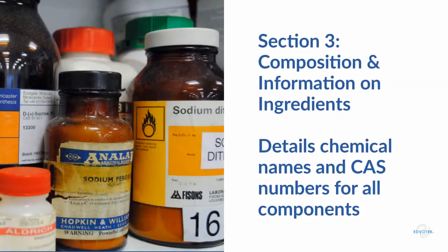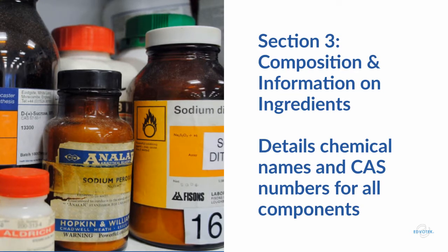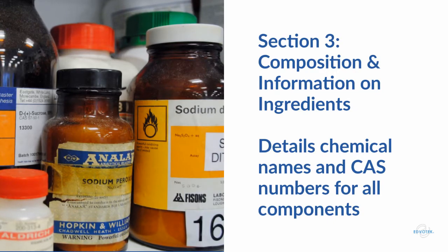Section 3 includes information on chemical ingredients, including the chemical name, the common name, and the chemical abstract service, or CAS number. For mixtures, this section provides information for all chemicals along with the relative percentages. Manufacturers can protect chemical formulations that are trade secrets, but they must still declare hazards and concentrations.